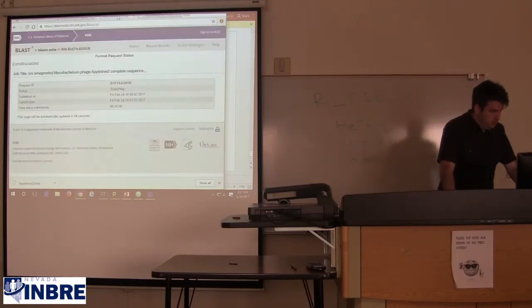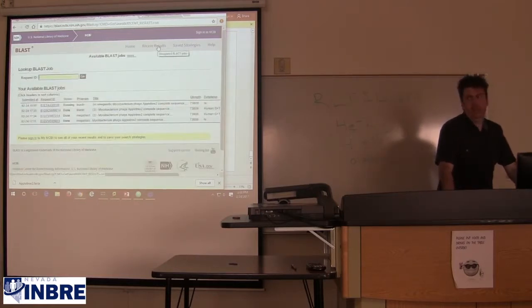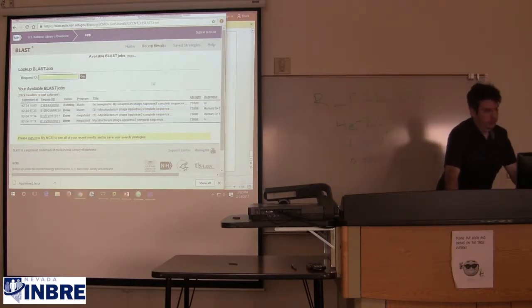Well, I'm just changing from the Megablast to the blastn. That's all I did. I didn't change parameters, but it's still running. It's still running. Yeah. I go to the recent results table, and then that way I can hit F5 or Control R or whatever to have it prove to me that it's still running. Mine says it's still running.